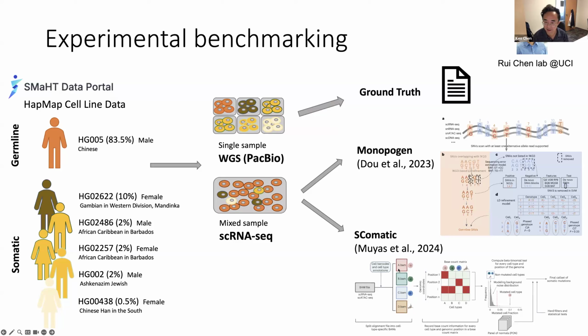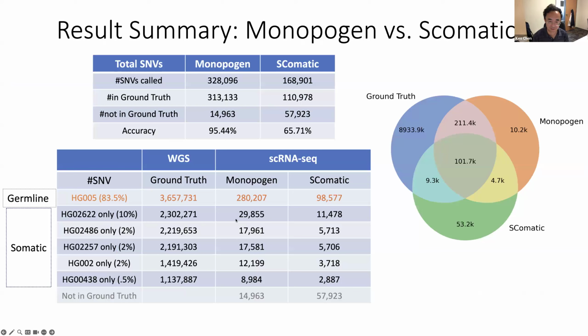We basically don't split everything into BAM files by empirical knowledge. We just automatically tell, based on the linkage disequilibrium pattern in the data itself, which one is somatic and which one is germline. So this gives us a lot more power, both sensitivity and accuracy, in determining cell type specific or sample somatic subclonal specific mutations, as you can show here. So I just like to clarify on that point. But your point is also important. Sometimes you don't even have many cells in the individual BAM files. So that's also another potential limitation of using that type of approach.